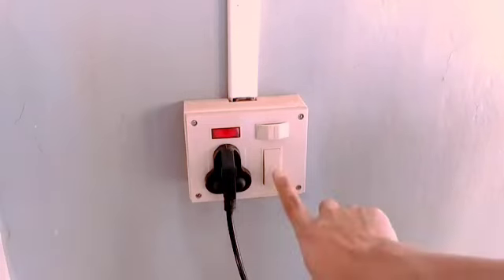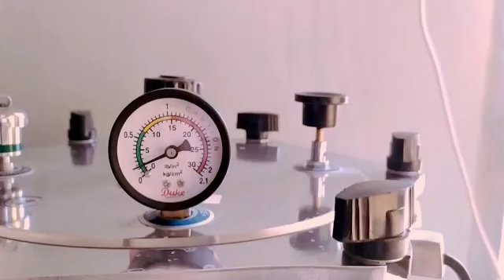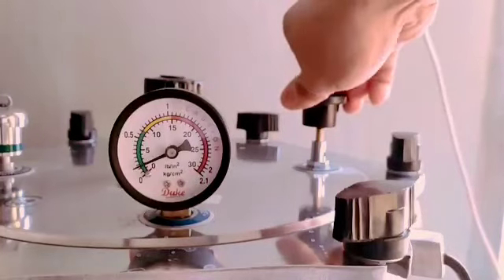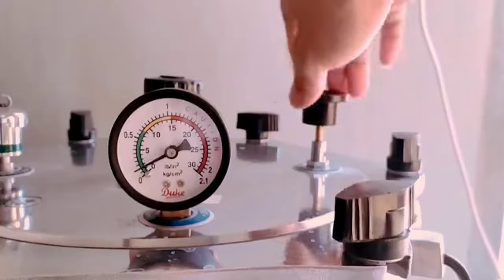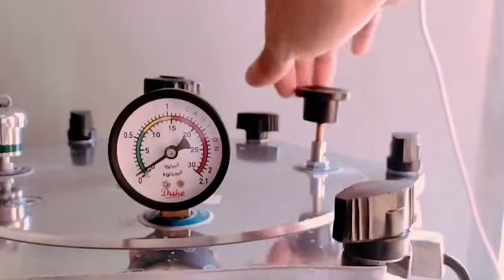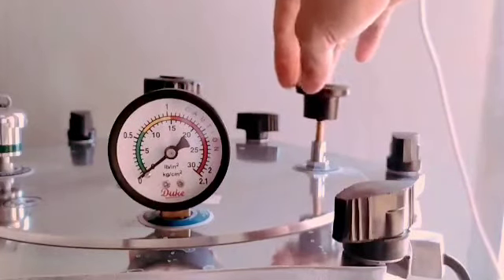Switch on the autoclave heater. Wait and observe the pressure gauge reading. Once the pressure within the chamber reaches about 2 psi, open the steam release or air exhaust valve to let out all traces of air that is trapped within the autoclave. This allows the chamber to be filled exclusively with saturated steam, which is necessary for an effective steam sterilization.